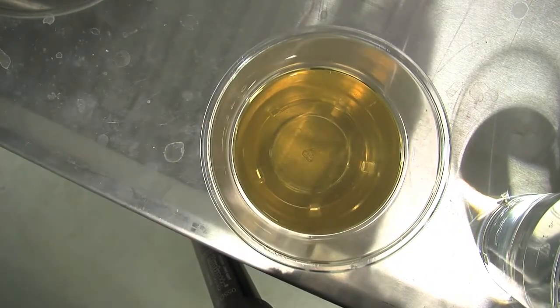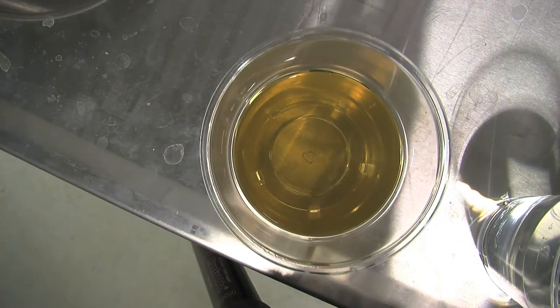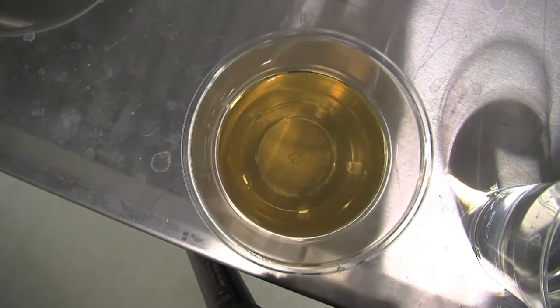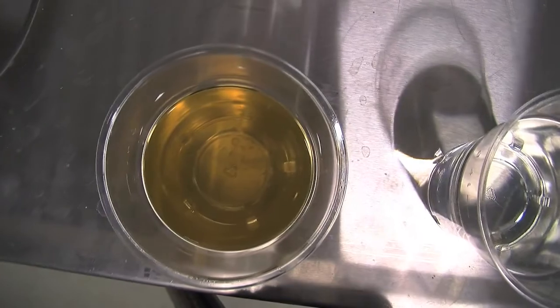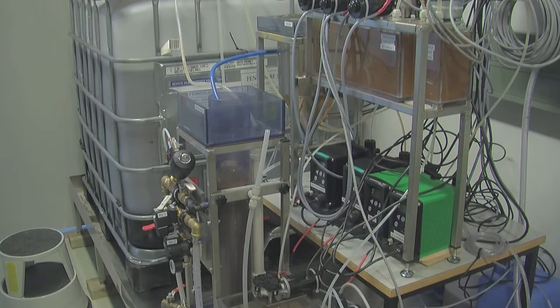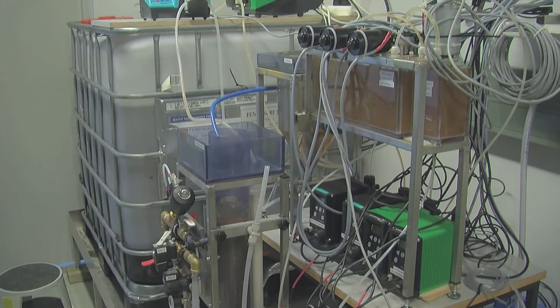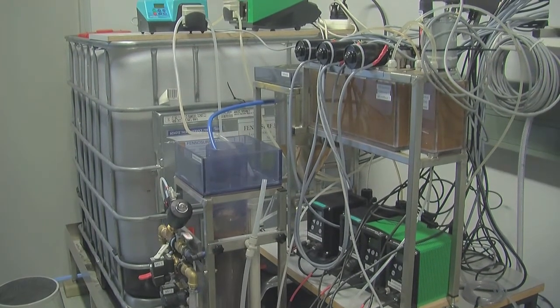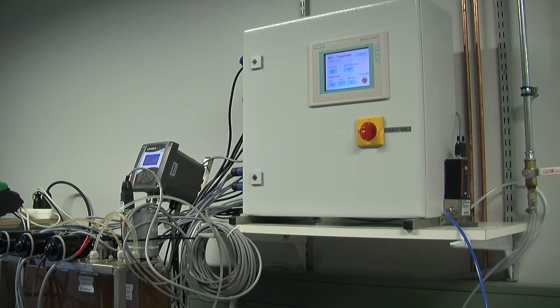Here we have before us 2 glasses of water. On the left, a glass of water drawn directly from Kurun River, from which the city of Vasa takes its raw water. On the right, a glass of water that has been treated with our benchtop scale waterworks here at our laboratory at the Vasa University of Applied Sciences. The apparatus is fully automated by using PLC control and handles the following unit operations and processes.